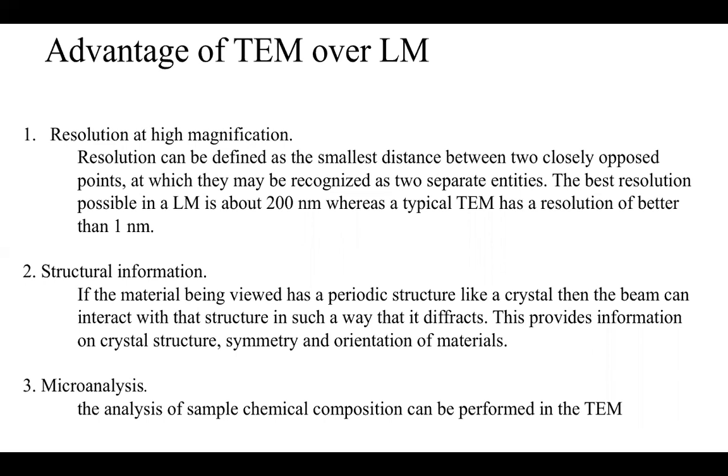Then your wavelength, let's imagine the distance between these 2 points and the wavelength are comparable, like they are at the same level.